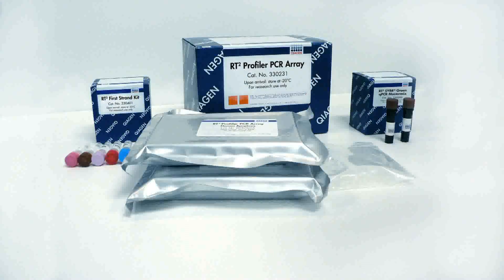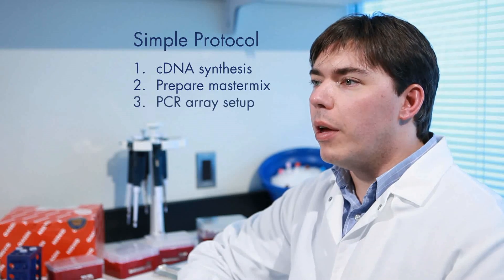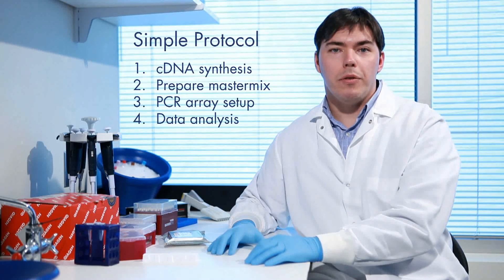The RT² Profiler PCR Array system provides reliable gene expression results across a pathway-focused set of genes for any sample quantity or type. In the next few minutes, I will demonstrate the simplicity of the PCR Array system for routine use in any research laboratory with access to a real-time PCR instrument.